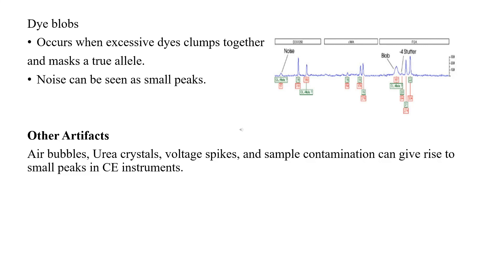Noise can be seen as small peaks. Other artifacts present in electrophoreograms can include air bubbles, urea crystals, voltage spikes, and sample contamination.